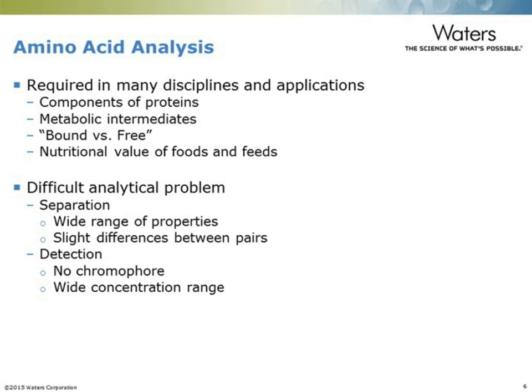It's a particularly difficult analytical problem because the separation requires that we deal in a single method with a very wide range of chemical properties that includes very small differences between pairs of analytes. At the same time, the molecules do not have a common detectable element and no chromophore and occur over a wide concentration range. This problem has been addressed in a number of ways over the years.